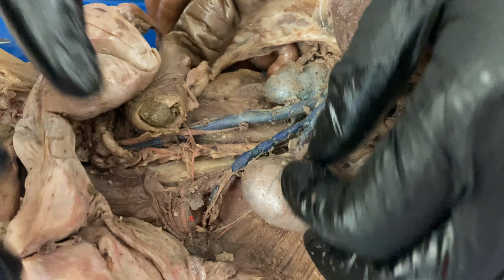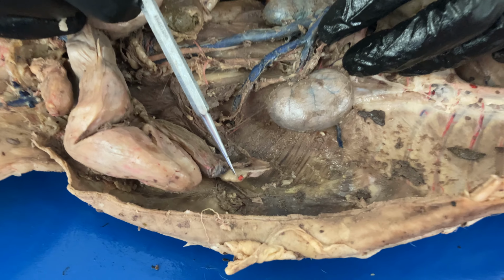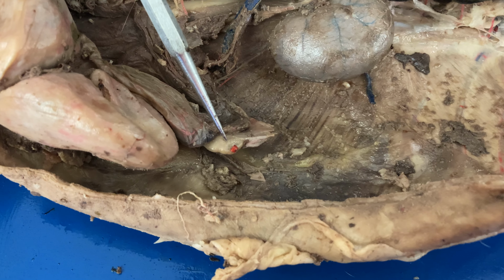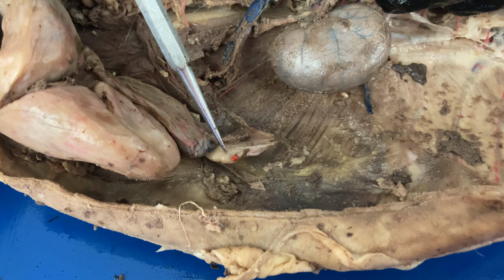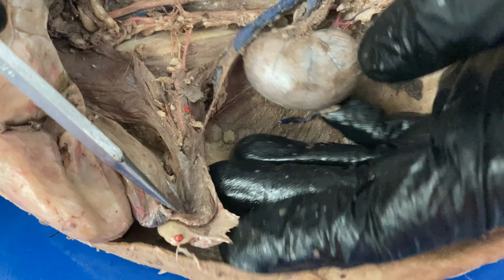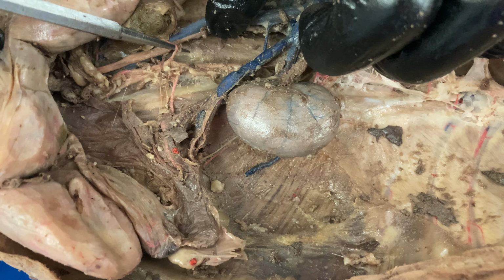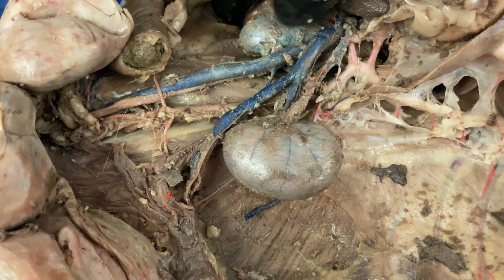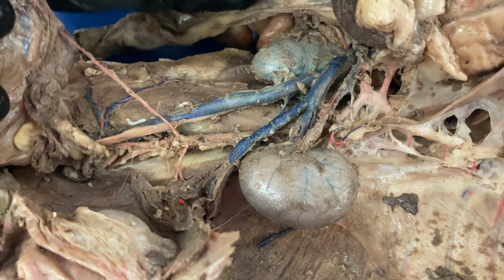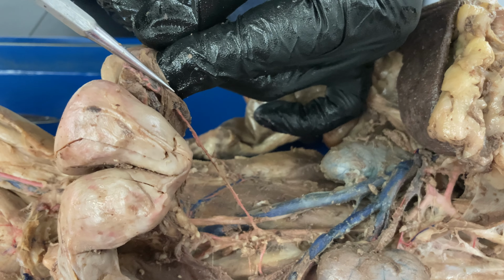Okay, so this is a female. So let me put her back the way it was. This little structure that you can see right there kind of looks like a pea-sized structure. That's the ovary. So we want to be looking for a blood vessel that comes to the ovary. Okay, so you can see if I spread it out, it's going to be this blood vessel coming here, and you can see where it attaches to the aorta. Here is the pair on the other side, which is going to come to the other ovary. And you can see the little ovary right there. You can see the connection.